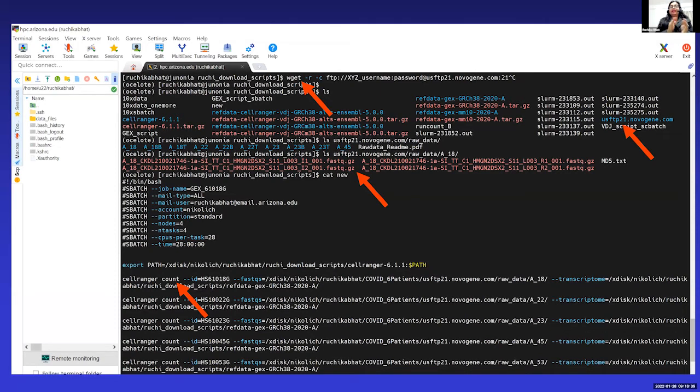But for now, cellranger count is a program that will generate an output folder, whatever name you want to give here, when you give the path where your data lies and a reference genome. For example, if it is the human genome you want to refer to, then you give the reference genome here, and that's how it will take that into consideration and generate the matrix file.